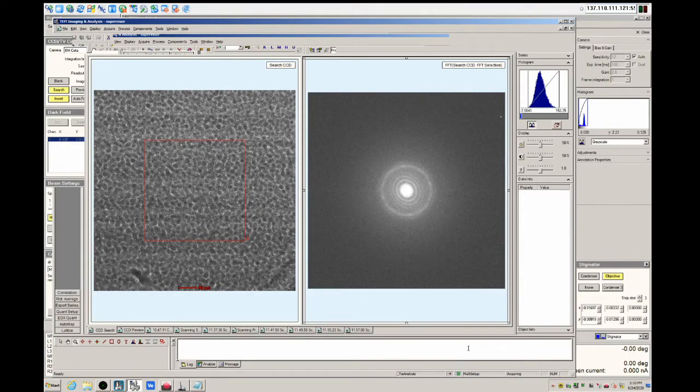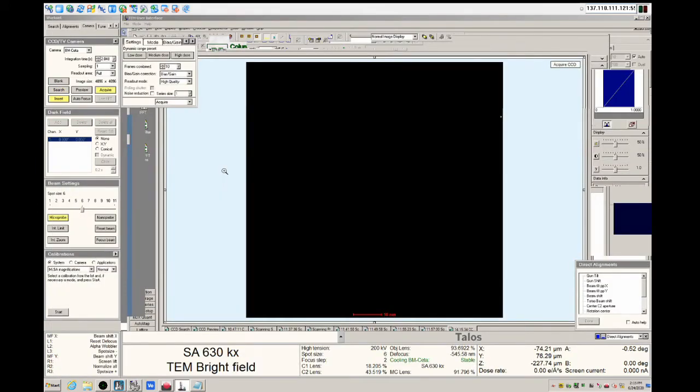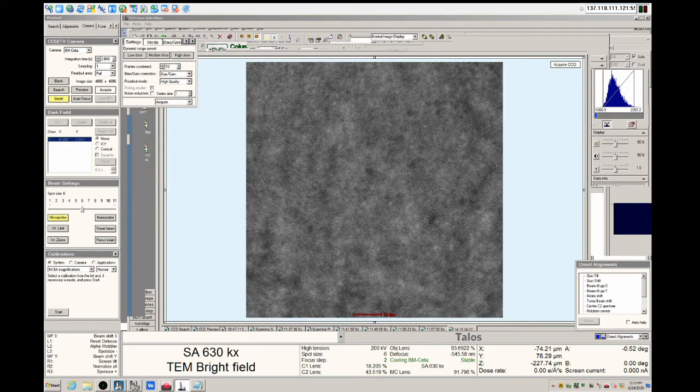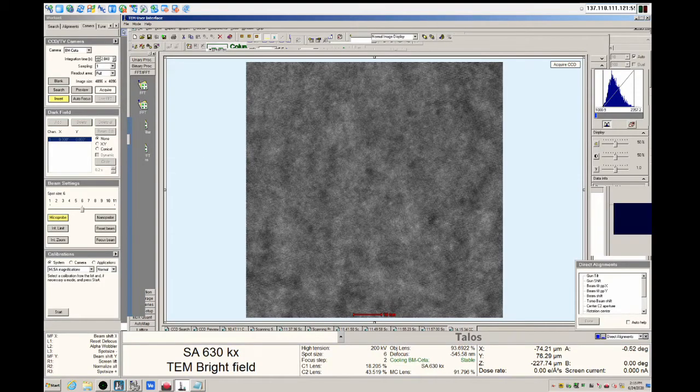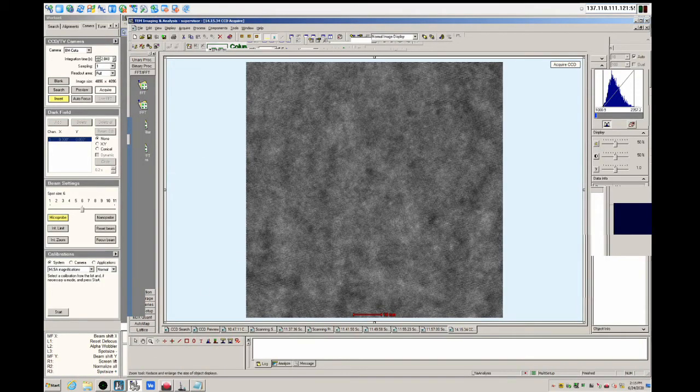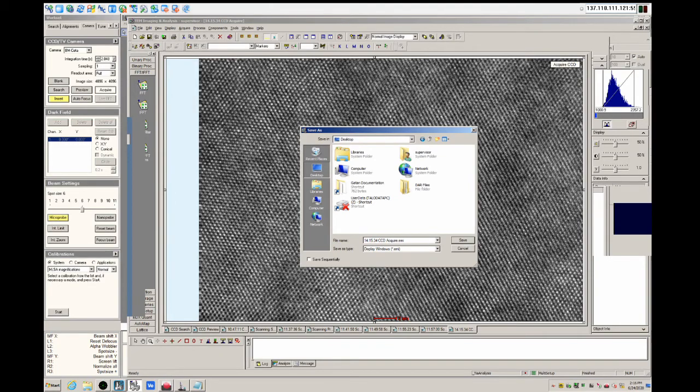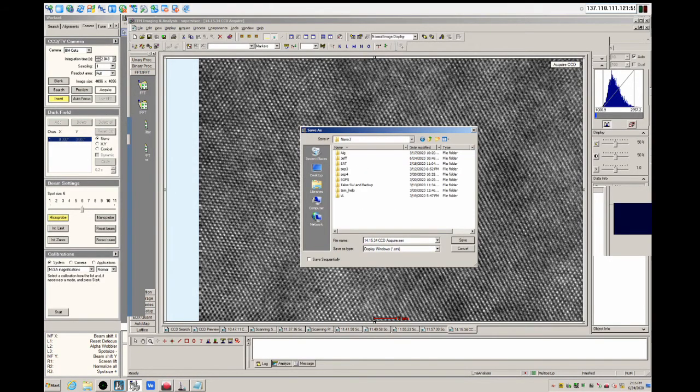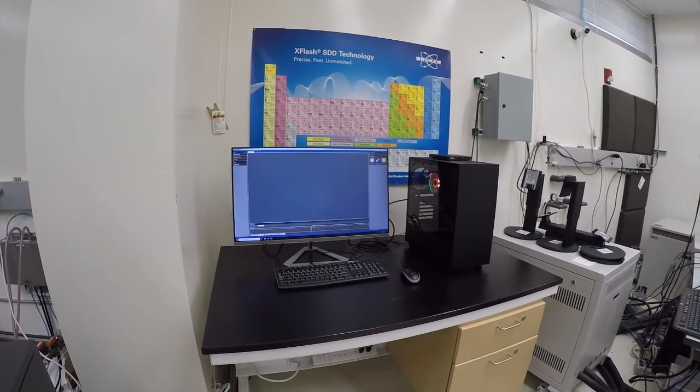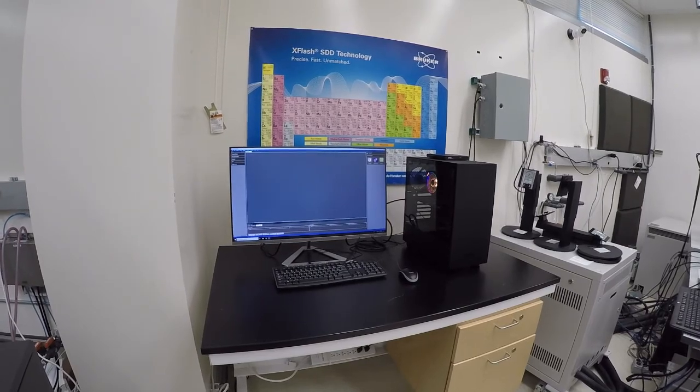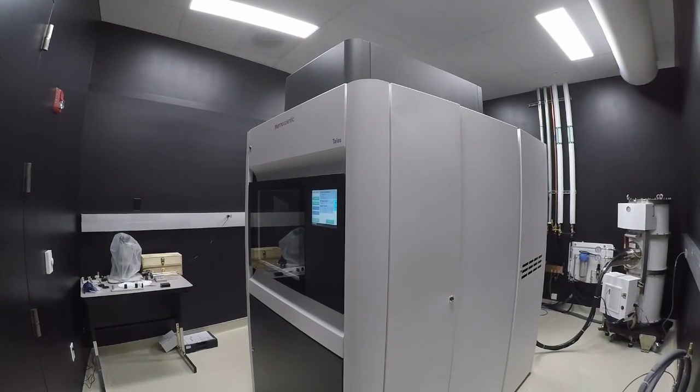These are all of the basic alignments, and now you can go ahead and capture some data. There are a whole variety of file formats that you will learn about during training. Many of the TEM file formats are proprietary to TEM software. Do remember that you need to save your data on the Z drive, not the local computer, because the files are very large. You can export formats such as JPEG if you wish, but also remember there is a TEM analysis computer in the microscopy lab loaded with advanced software that allows you to open the proprietary formats.